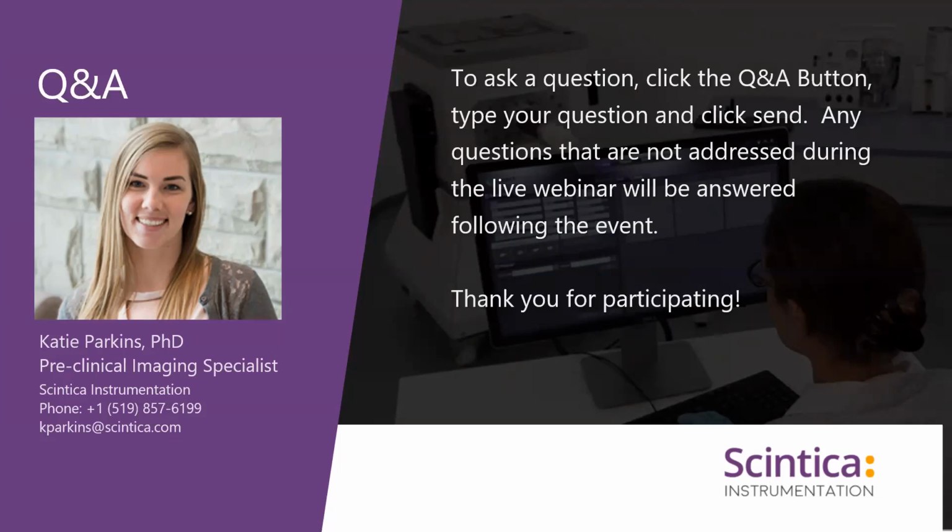because you want to make sure that you're administering the substrate before sacrifice, giving it a couple minutes to circulate throughout the body, getting to those cells of interest, and then you would sacrifice your animal, and right away, you need to get those organs out. And that can be really great, as I mentioned, to better localize the signal, because now the signal is going through much fewer layers of tissue to get that light out. So that can really help if you have a lower detection limit.